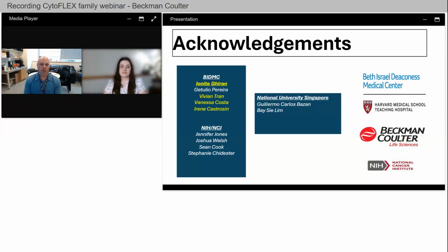By using things like FCM Pass or Rosetta or any other self-made program that someone comes up with, getting out of arbitrary units and moving to standardized units really helps you do instrument to instrument comparison and institutional comparisons, and even work with colleagues in Australia, Japan, Europe, everywhere. There are papers about it where you can see how these things are actually done. This has been a major focus even with the instrumentation.